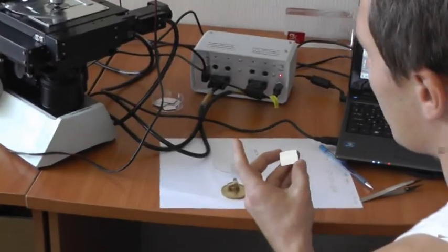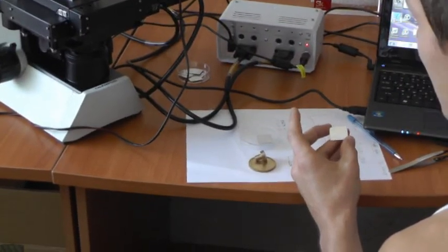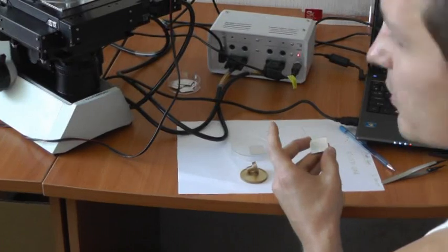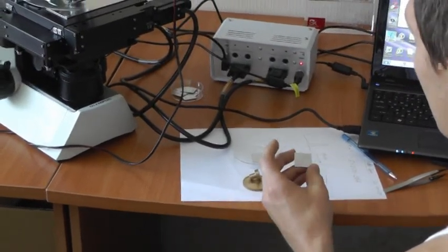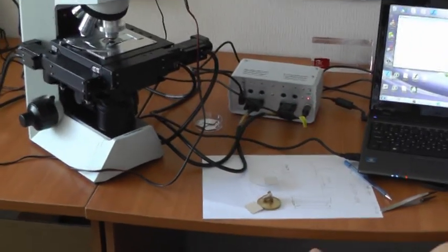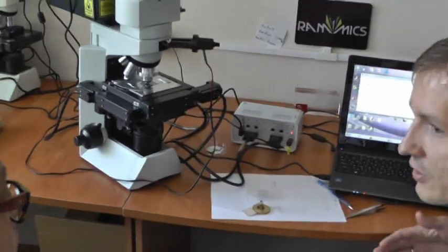To identify components of powders, like in medicines, pills, this specific procedure requires sample preparation.